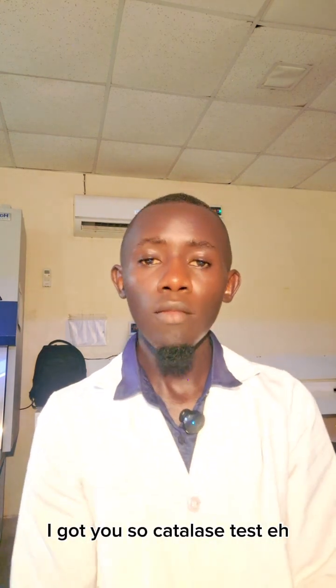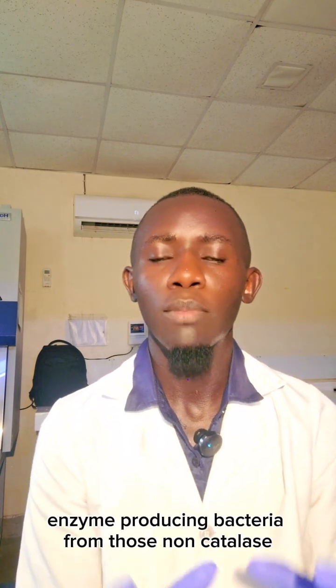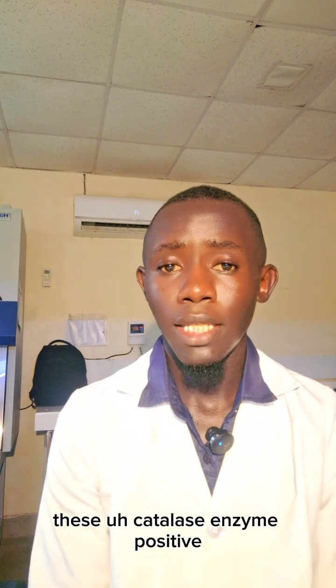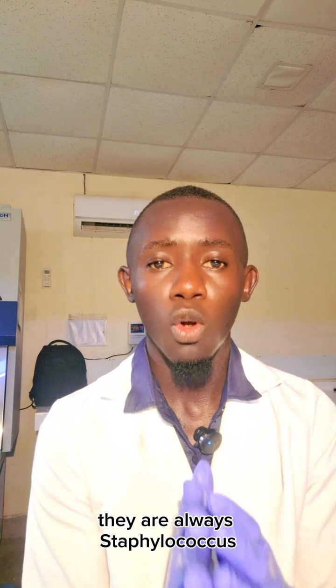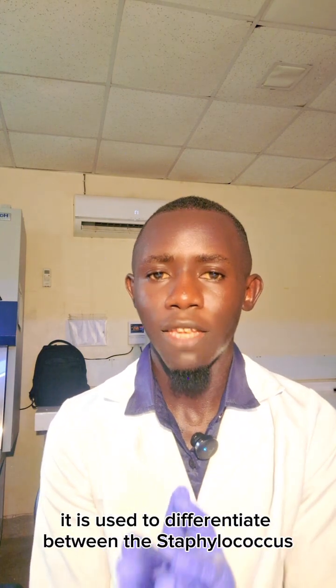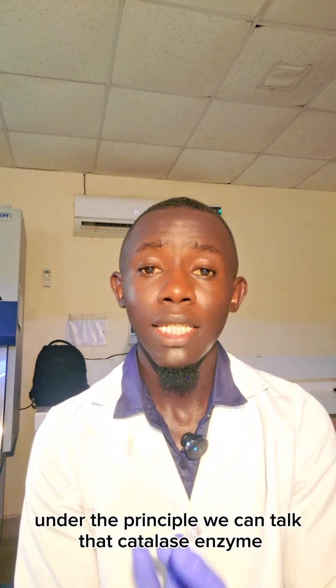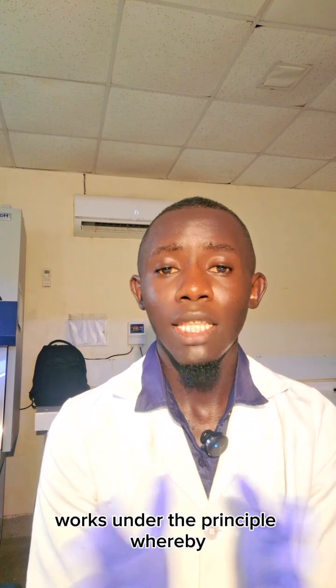So, as we have said, the catalase test is just a basic biochemical test used to differentiate between catalase enzyme producing bacteria and those that do not produce the enzyme. The catalase positive ones are always Staphylococcus, and the catalase negative ones are always Streptococcus. So basically, it is used to differentiate between the Staphylococcus species and the Streptococcus species.